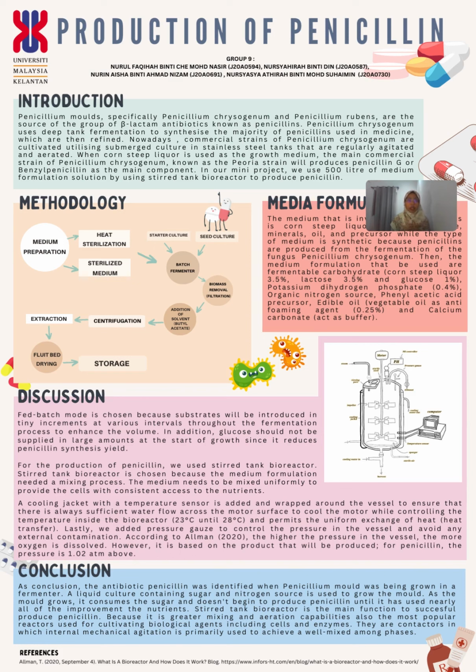In our mini project, we use 500 liters of medium formulation that we have stated in our method, using a stirred bioreactor to produce our penicillin.